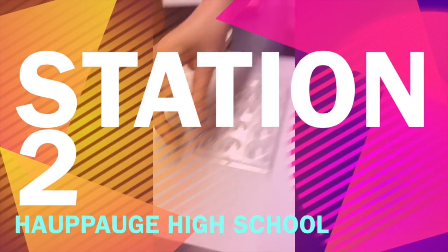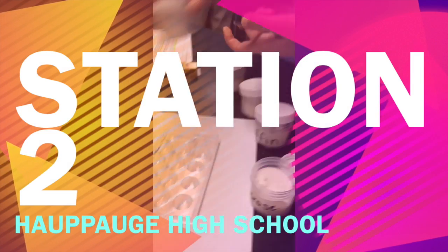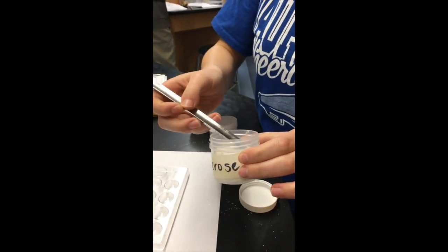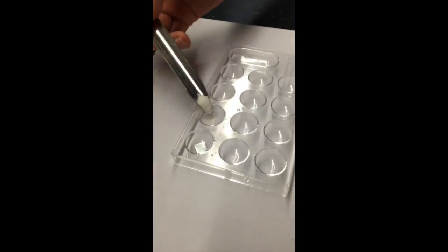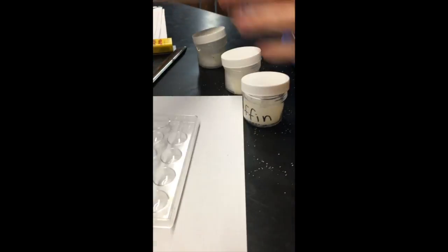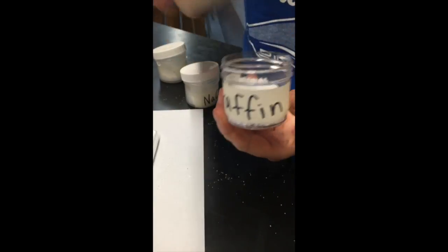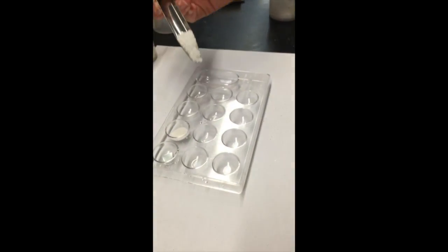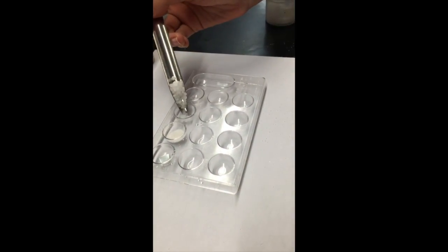In Station 2, we are going to be testing the conductivity of some substances in their solid state, as well as these substances in an aqueous solution. So first we are going to be testing zinc, which is a metallic substance, and then we are going to be testing sucrose, which is a covalent molecular compound. Next is paraffin, which is a covalent compound.